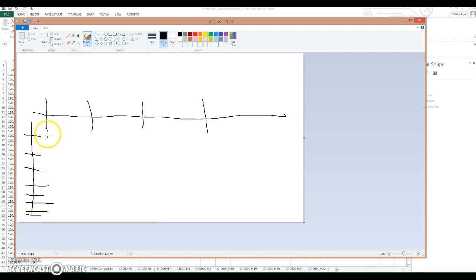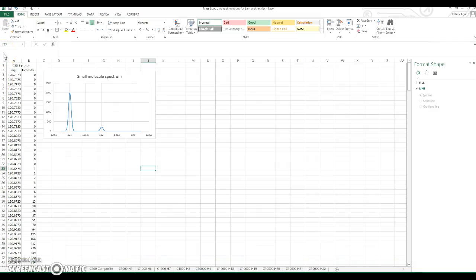Now, how will you know where, for example, this one is? Again, this was number of carbons, and this was the same thing, but this is number of protons. So how the heck are you going to find that? Well, they're all here in this little Excel file. So it's coded thusly: carbon number here, proton number here. So this is carbon 10, 1 proton. And that's all we're going to show for the students because that's all you'll ever see in reality. So I decided to confine this matrix to reality.